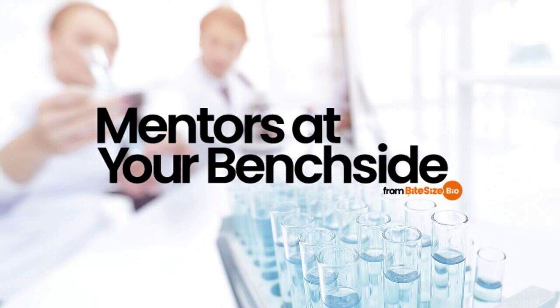Reason number 8 your plasmid yields could be low: isopropanol quality. Many labs have isopropanol in large containers that have been opened and closed over the course of a year or more. For the best result in the precipitation step, make sure the isopropanol used is not the old bottom of the barrel stuff. Use some isopropanol from a new bottle or a smaller bottle that is not who knows how many years old. This makes a huge difference in the size of the DNA pellet you obtain after centrifugation, and therefore your plasmid yield.